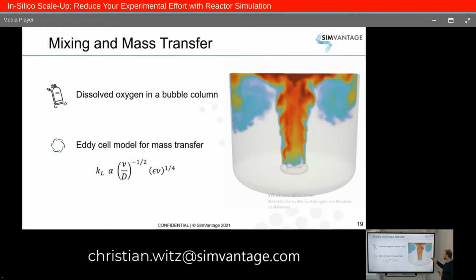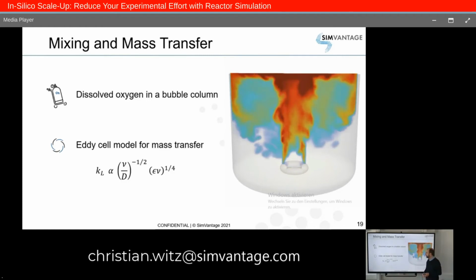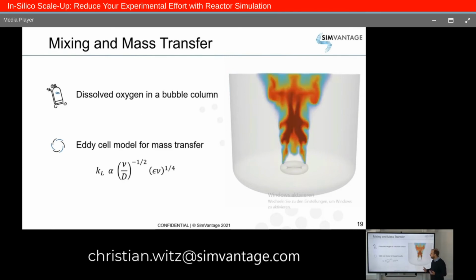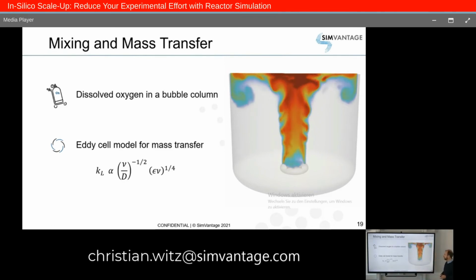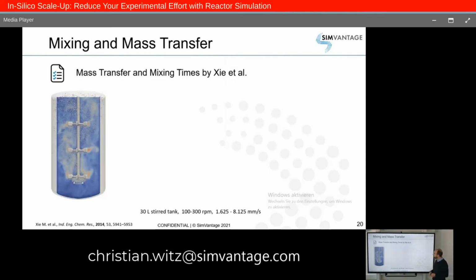And for the mass transfer from the bubble to the liquid, we use the Eddy-Cell model, because it has been shown that this Eddy-Cell model gives the best results for a normal operation of the bioreactors. And of course we have to validate this as well.